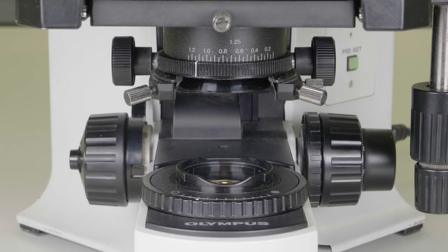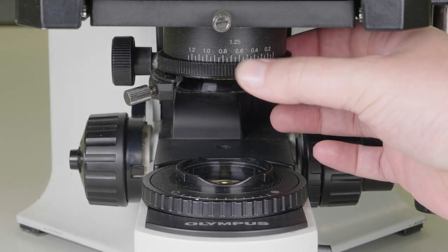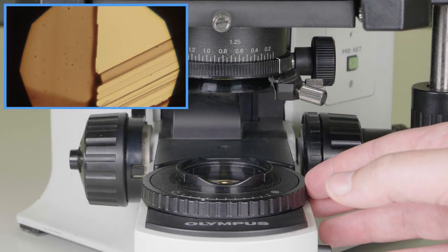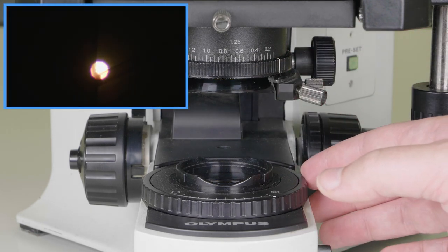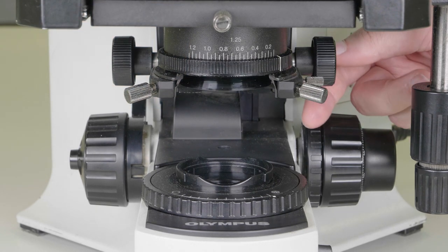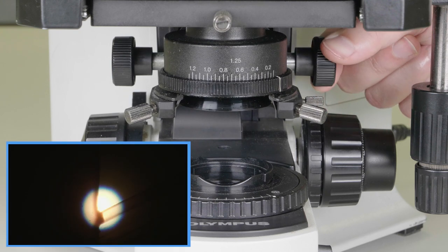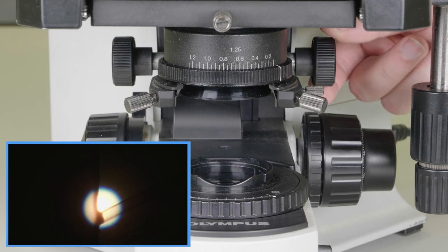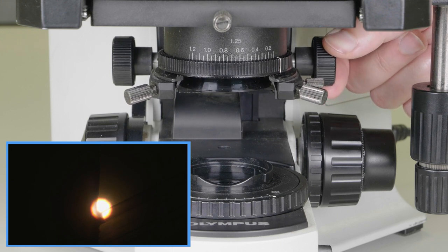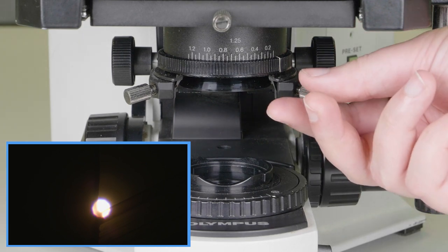Next, we are going to close the aperture iris and the field iris. In the box at the top left, note what happens when the field iris is closed. We get a dot of light. This dot of light helps us to set the correct height of the condenser. Adjust the condenser height until the dot of light is at its smallest and you can see a sharp black border to your dot of light.